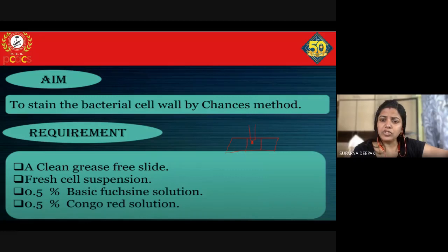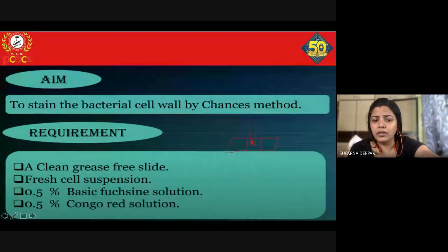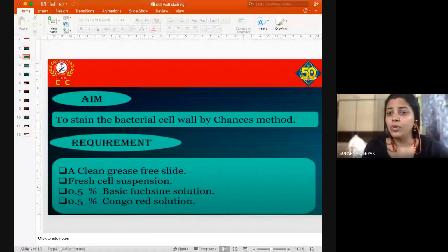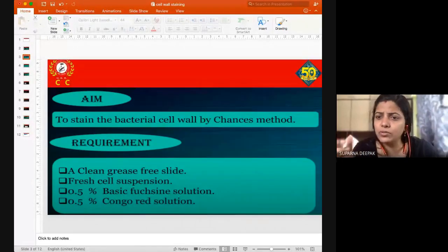The objective is so close to your slide that it is literally touching the slide. You have the slide and the objective, and the objective should be dipped in, or in contact with, this drop of oil. That is how oil objective lenses, or oil immersion lenses, work. So what happens is, the same slides you are going to use many times.